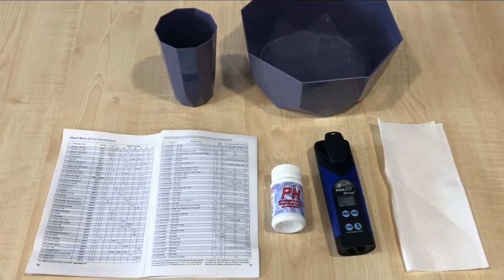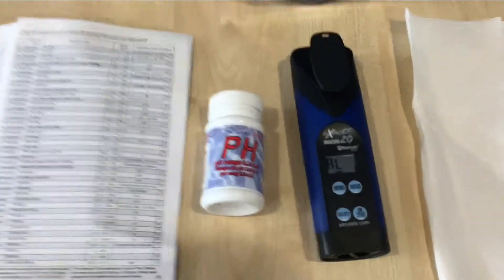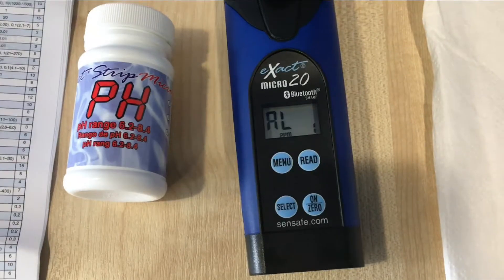Hello, we're going to be performing a pH test on the Micro 20. First of all, we put the batteries in the back, turn it on with this button, and it shows you the first menu that is available.